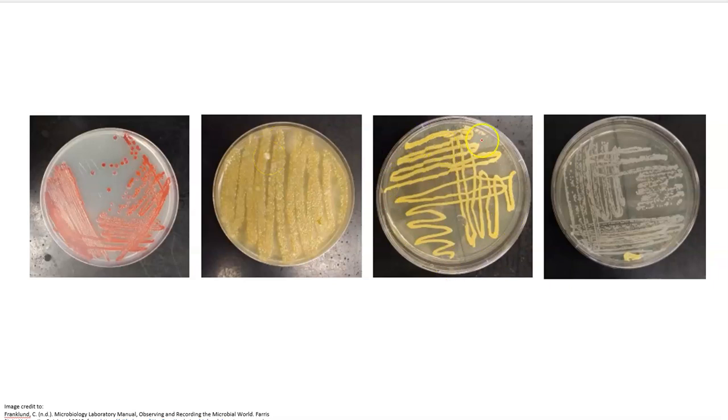Then we have this streak plate here where we can see there was an attempt at doing the streak plate technique, but we don't have any isolated colonies. It's just kind of a solid growth where we did the streak lines. A couple of things probably happened here. One, possibly starting out with too much bacteria. Also, it looks like they failed to incinerate the loop in between each pass.